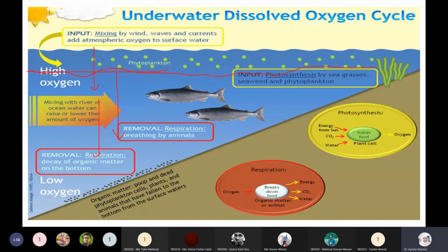So that's why, when you are sampling these things, you use a special kind of sampling vessel which will only open at a certain depth. That means you can control the stopper of that bottle. You can do it simply by using a Winkler bottle. We will see what those bottles are and make sure that it only opens when it goes down, and that nothing else can go inside when it's filled with that water sample.